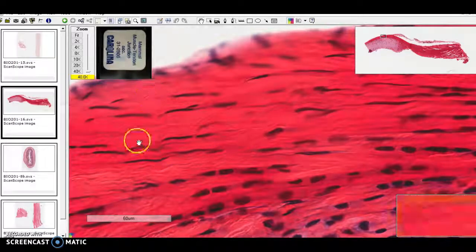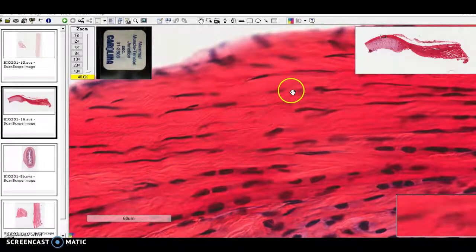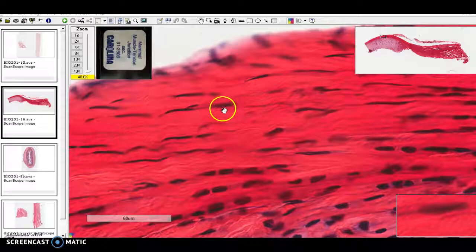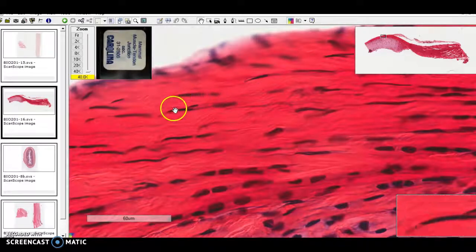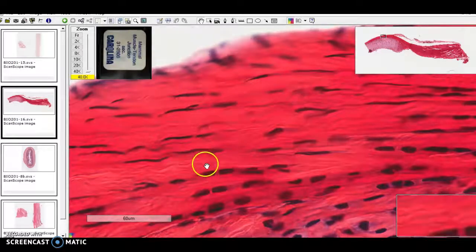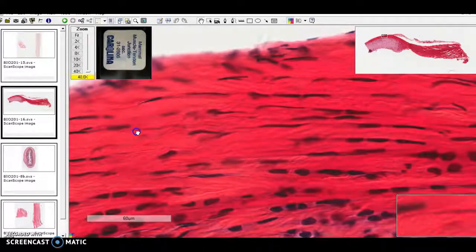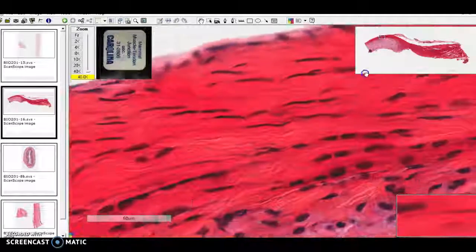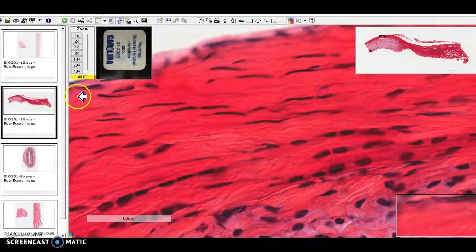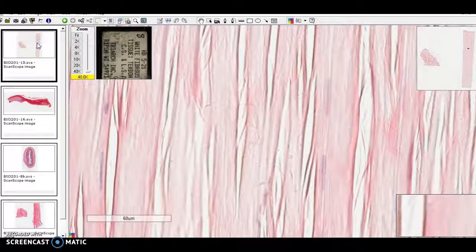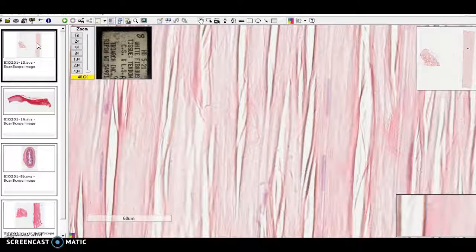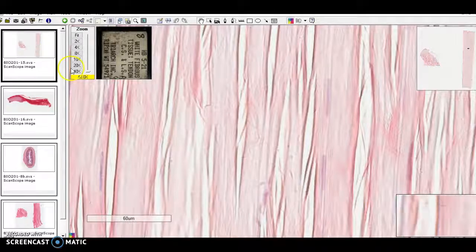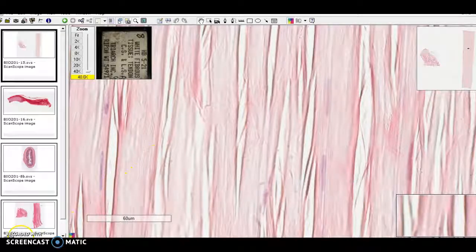It has no cross striations like the skeletal muscle. It's got these crunched or sad nuclei of the fibroblasts being crushed by their own products. So dense regular connective tissue makes up tendons and ligaments and basically doesn't have a lot of other features.